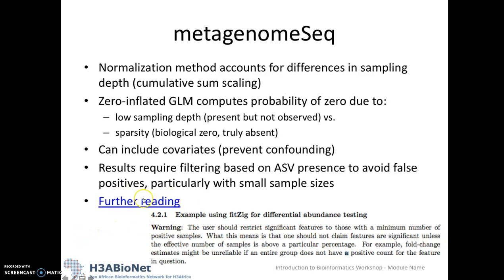For further reading, you can click on this link, and that'll give you more information on metagenomeSeq. You'll find a video presentation by the author that you can go through if you're interested in more of the theory.